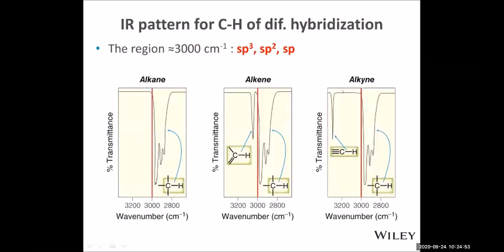And so that's actually what the infrared spectra look like. The first one is just an alkane. The alkane has only sp3 hybridized carbons, and the absorption is mainly around 2900. You can see that 3000 is the cutoff line. At 2900 is where the alkane C-H bond absorbs.